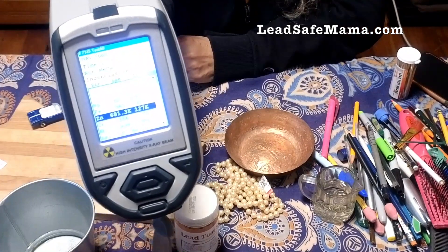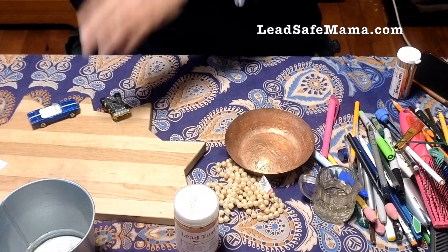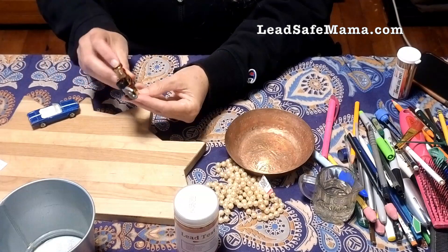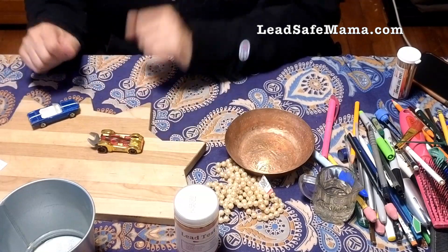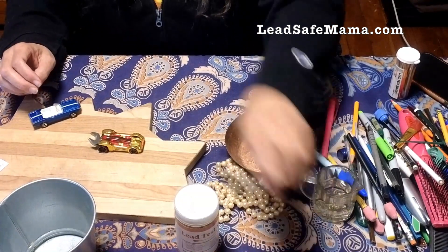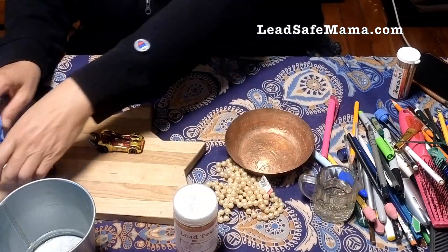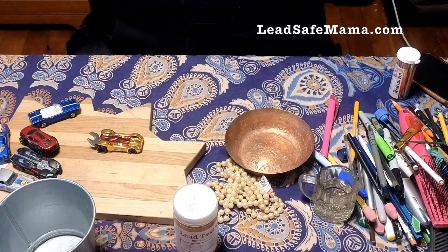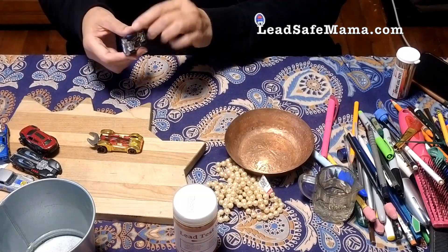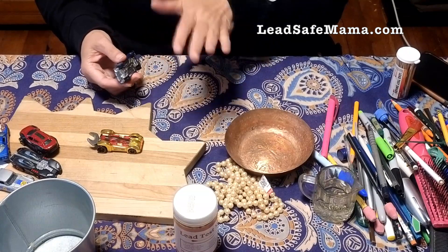The black band confirms 681,000 parts per million zinc and it is lead free. We have this known lead-free matchbox car, which I get questions about a lot. I have a whole collection of matchbox cars here — these are all lead free. There is not an issue with matchbox cars having lead unless they have the rubbery wheels. Those can have lead and cadmium, but if they have the hard plastic wheels, they are the newer type that tend to be completely lead free.